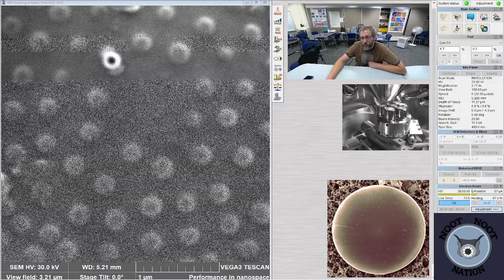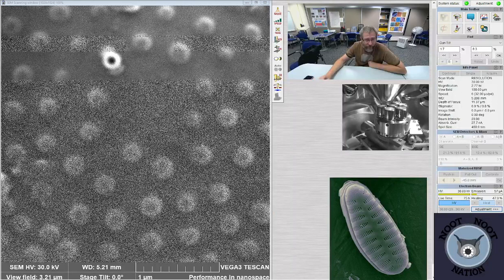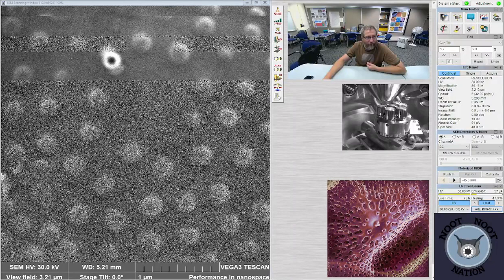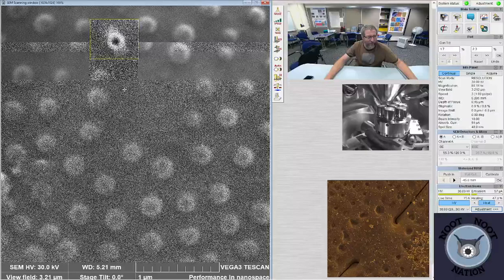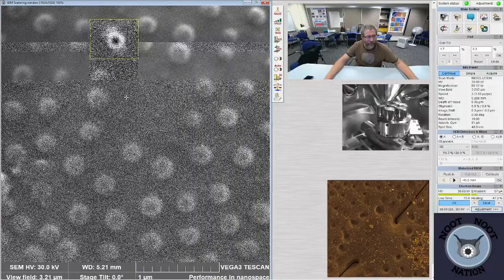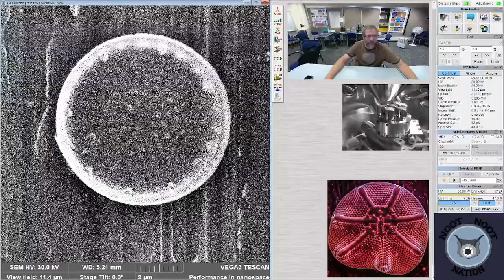So to get to your question, Sam, there's a couple of reasons why you can't really see DNA with an SEM. Well, not with this one anyway. One, living material, like organic material, usually doesn't do very well in a vacuum. That's probably the bigger issue, that everything's taking place in a vacuum. But also DNA is a little bit smaller than you would typically be able to see easily on an instrument like this.